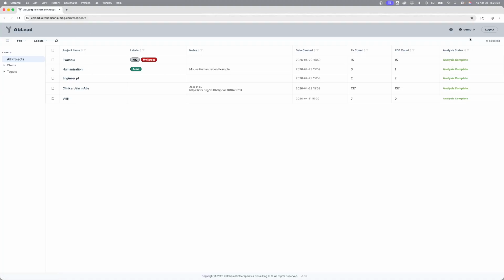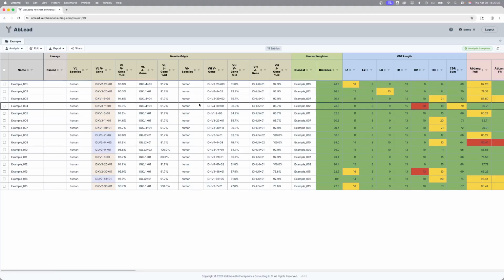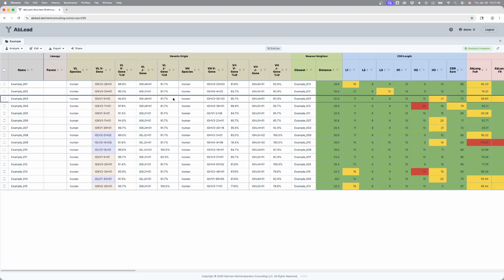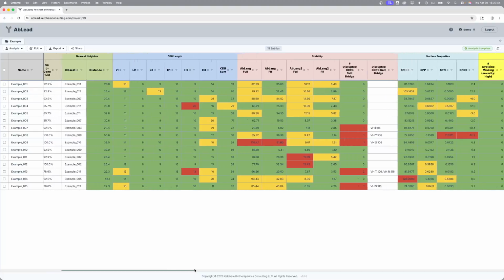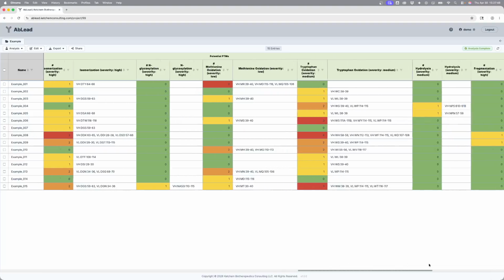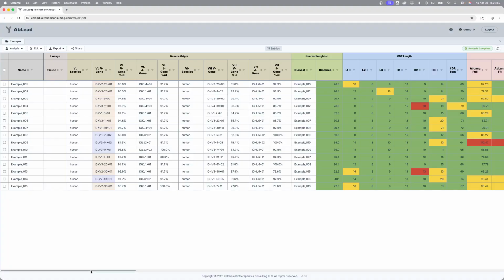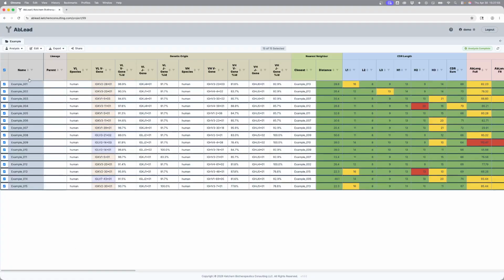You can see the dashboard characteristics and an overview of the rank ordering analysis in my first video. As I covered before, this is a set of entries in a project with various attributes pre-computed and a scoring system to allow for rank ordering. But oftentimes it's beneficial to be able to do further analysis on a system like this.